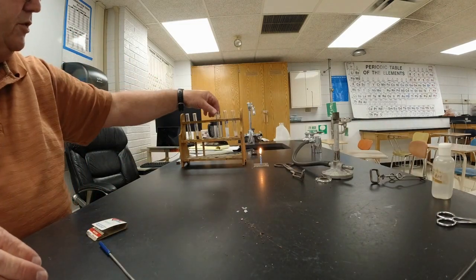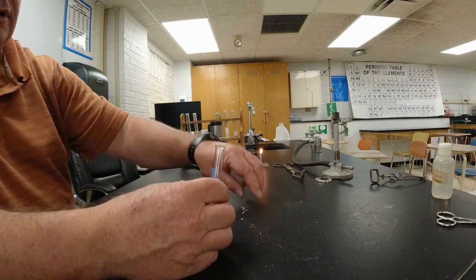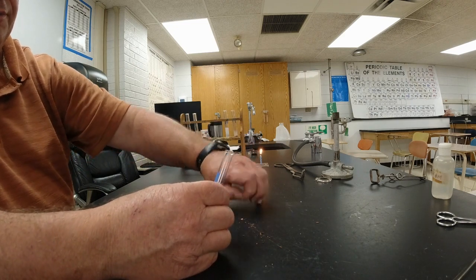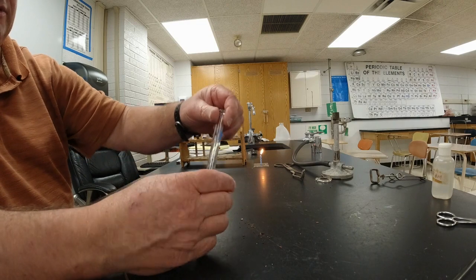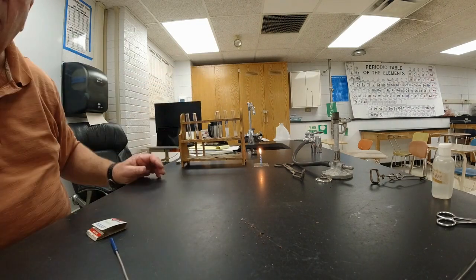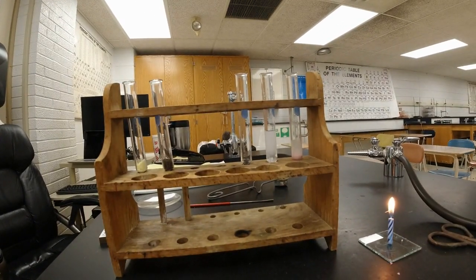All right, so what I'm going to do is take these 5 little pieces of magnesium and put them in a test tube here. And then I'm going to move this over here so you can see this a little better. I'm going to take some hydrochloric acid.